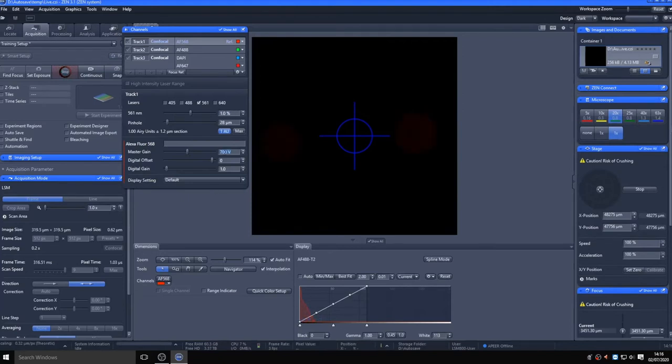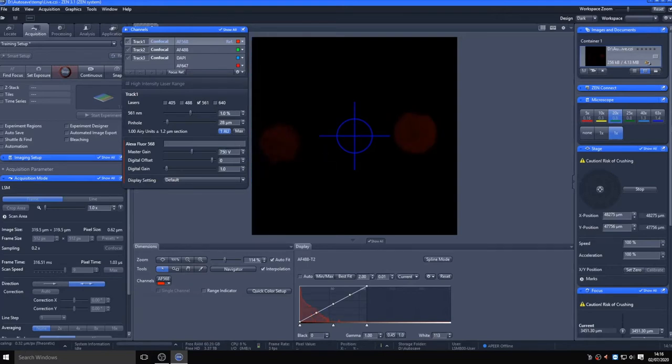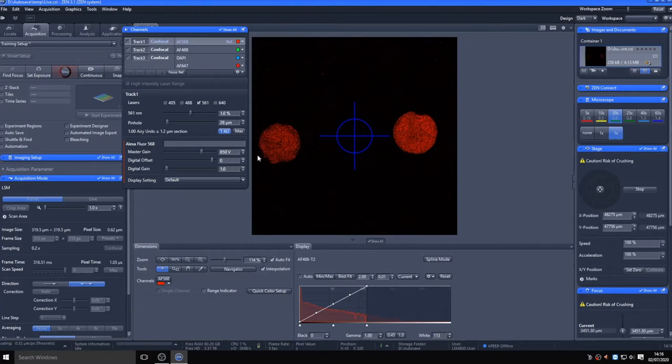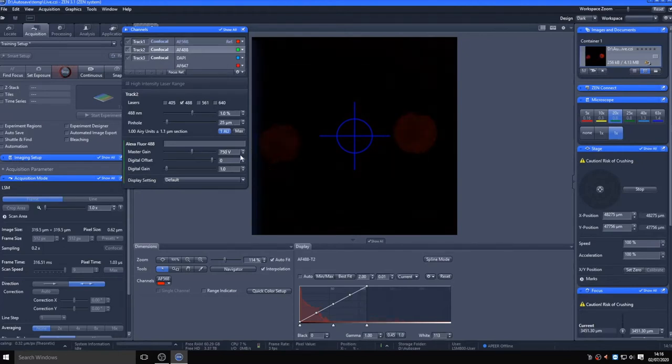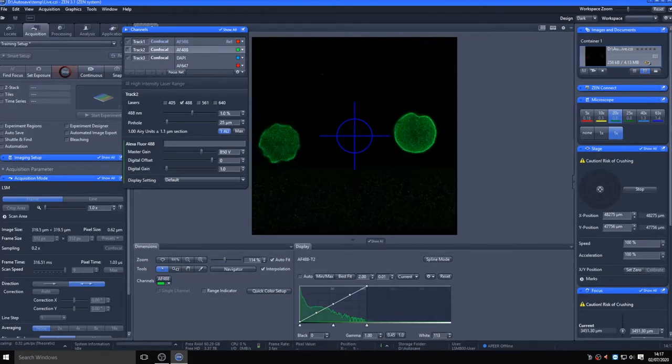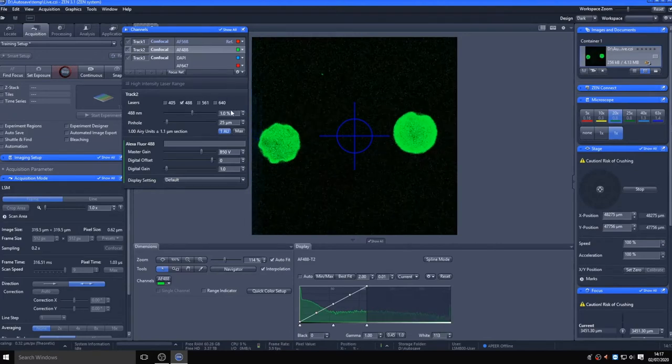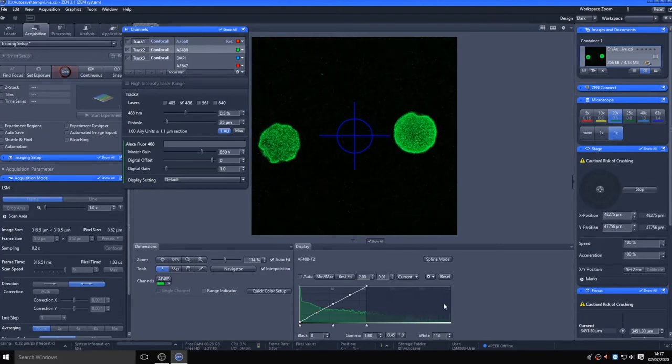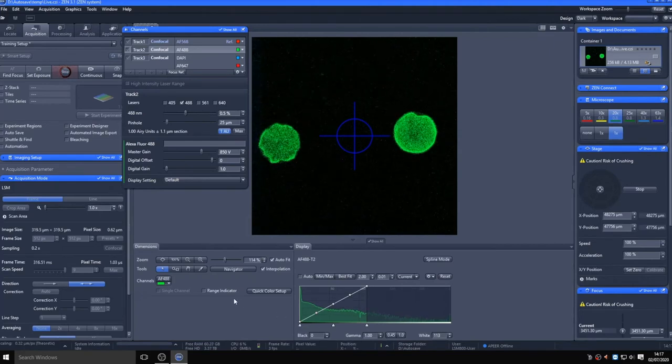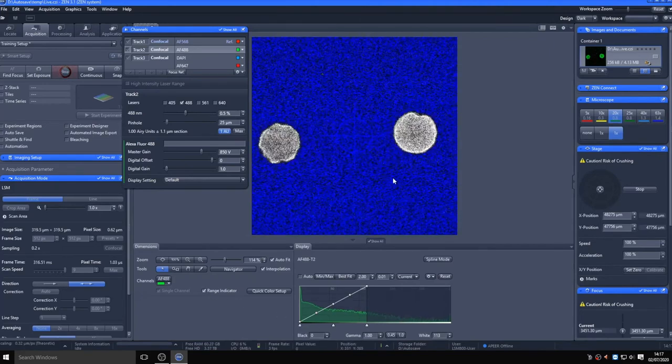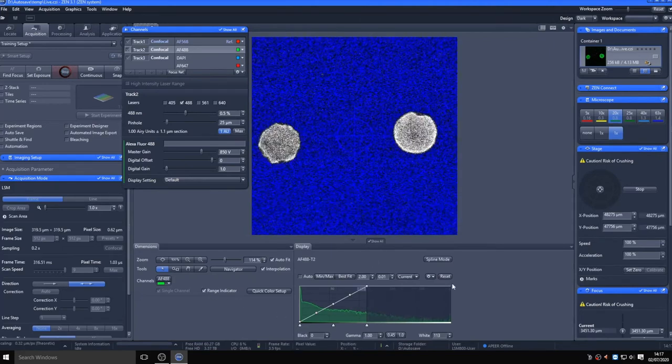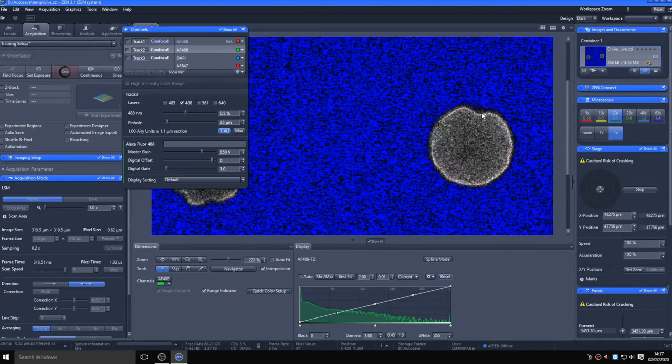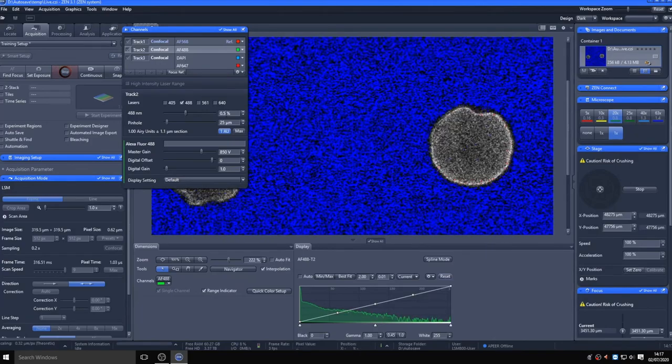We won't go over experimental design here, but it should be obvious that you need to ensure your positive controls aren't saturated and that your negative controls are negative at the settings you use. And once set, you should ensure all settings remain constant for all samples within an experiment.